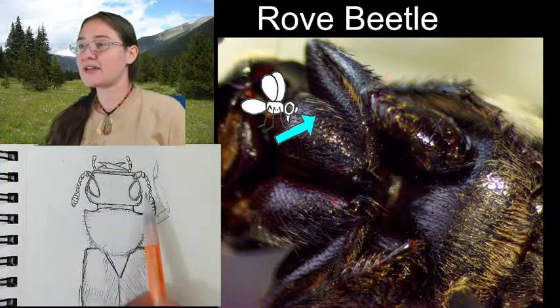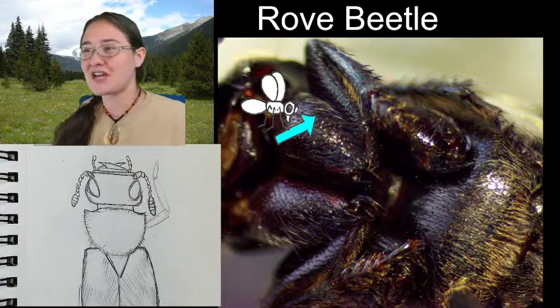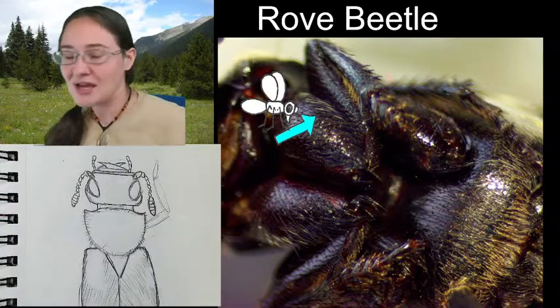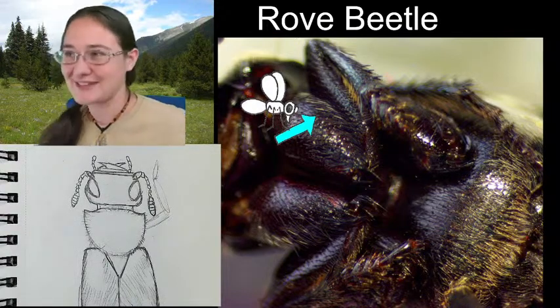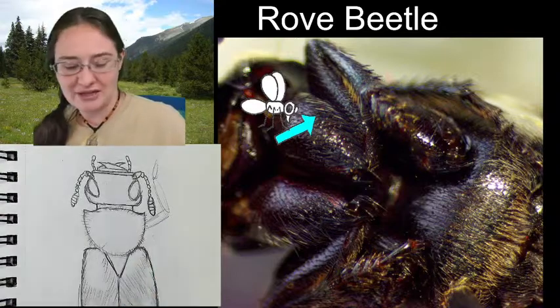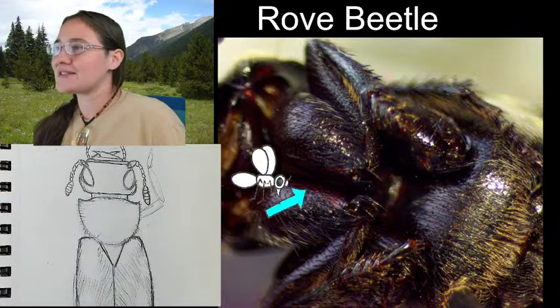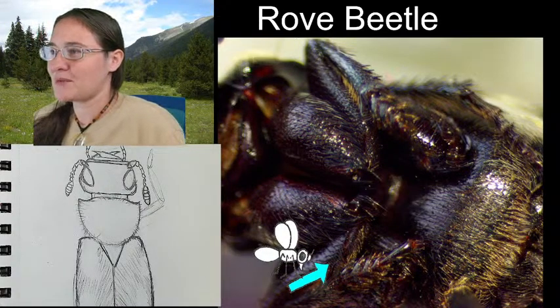So that leg is going to come out looking like this on both sides, but a lot of times when I'm sketching with you guys, I only end up sketching one set of legs. I know a lot of you have time to sketch both sides, but I have movement and microscopes and things to do. So that's about what my front leg is going to look like. My middle leg, we can see an example. Maybe we can't. Maybe we're going to have to move it really quick.